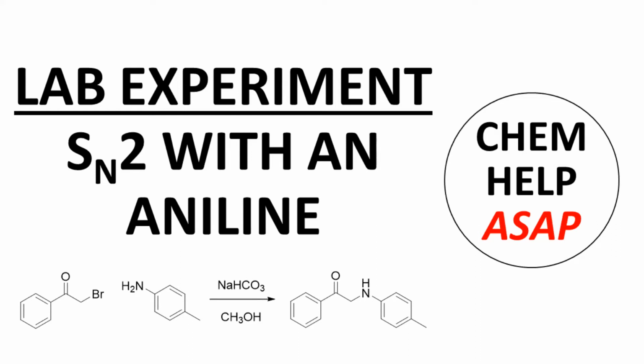In this video, we'll demonstrate a classic organic reaction, the SN2 reaction. Specifically, we'll do an SN2 on a primary bromide with the NH2 of an aniline. We will briefly discuss the reaction, perform the experiment, isolate the crude product, and characterize the material. Handouts for the lab procedure and NMR spectra are available through links in the video description.